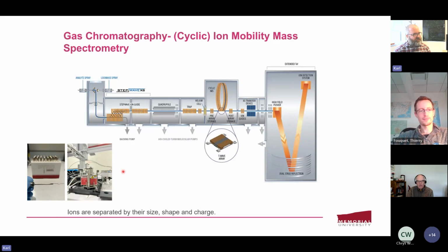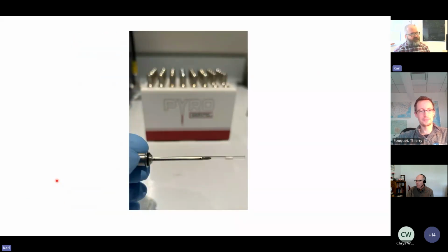This is the Gerstel offering, and you have relatively small probes. I'll show an expanded view here. This quartz pyrolysis tube can hold about 40 or 50 microliters of extract. So it is possible to roll a small amount of filter paper and directly insert it into the probe tube. You just have to have really talented students like mine to do it.